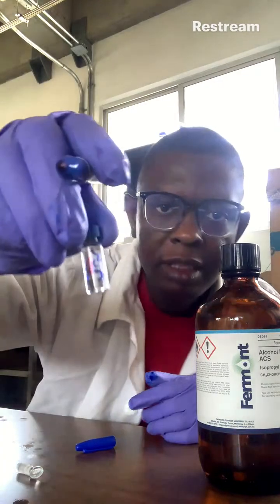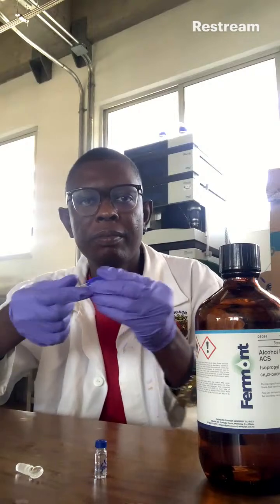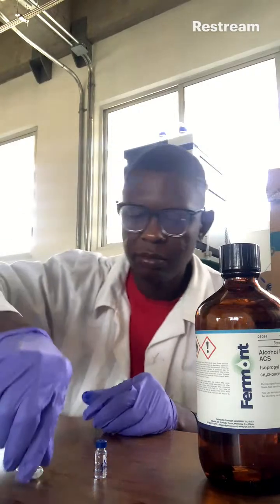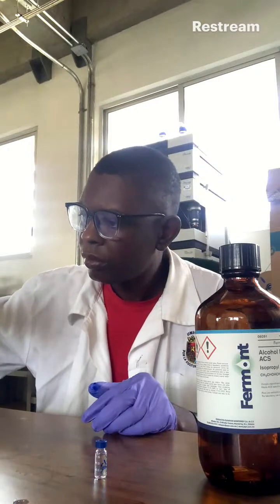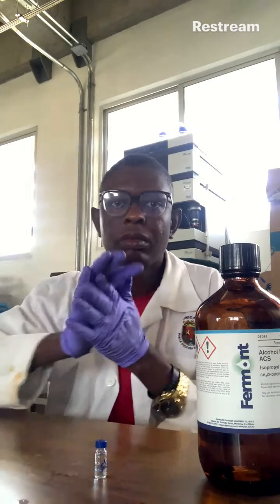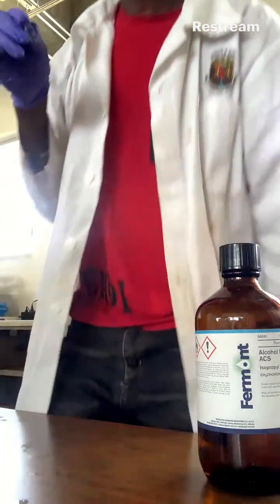So I've named it standard. So I'll take my standard to the machine.